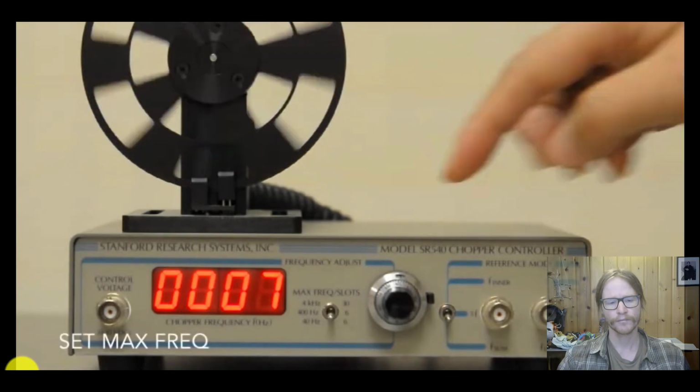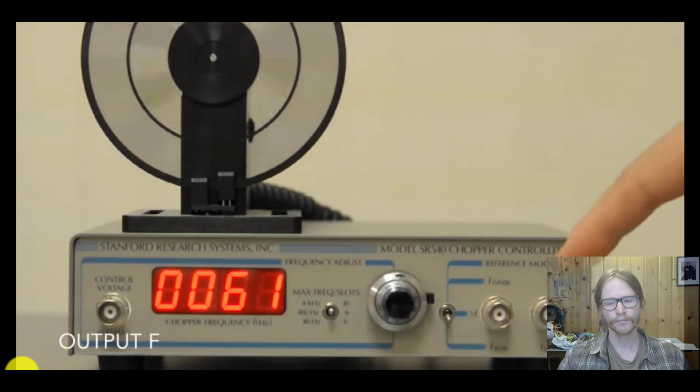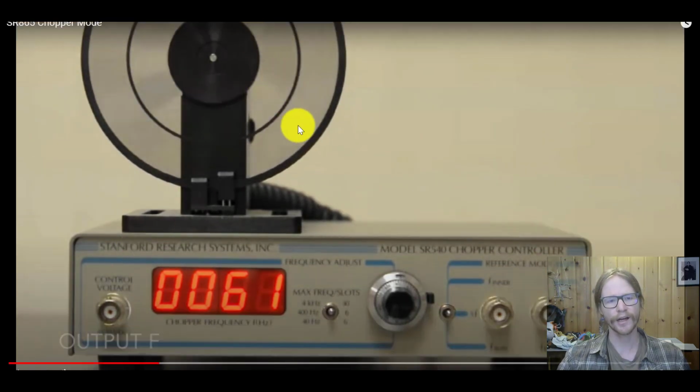I'm Ian Chan at Stanford Research Systems. This video will show you how to use an SR865 lock-in amplifier to phase lock an optical chopper to the lock-in amplifier. Let's set up the SR540 chopper controller. We're going to use the 6-slot blade in this video, but the setup works equally well with the 30-slot blade. For the 6-slot blade, we have to use the 400 Hz setting. We also want the reference to output F. So you can see how the chopper is moving.